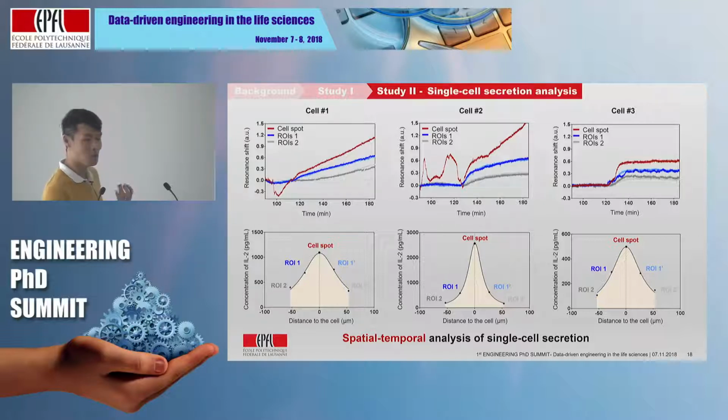Here we only put the cells there without any support of the stroma of the microenvironment. But in a recent study we created a biomimicking surface on the gold plasmonic arrays by putting on a lipid bilayer to mimic a cell membrane. Then the cells can behave more like in an in vivo microenvironment. That is the ongoing research we are doing.